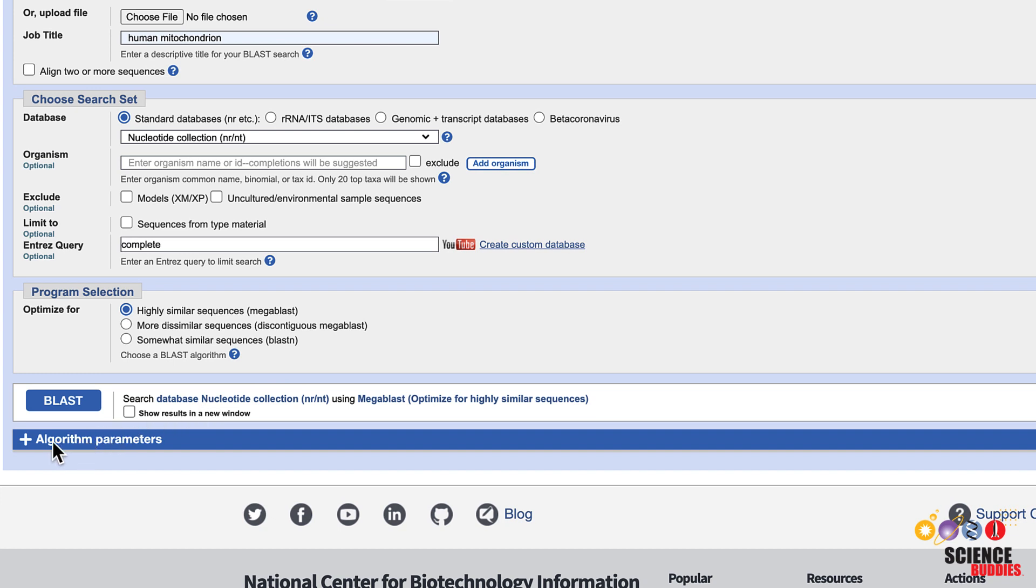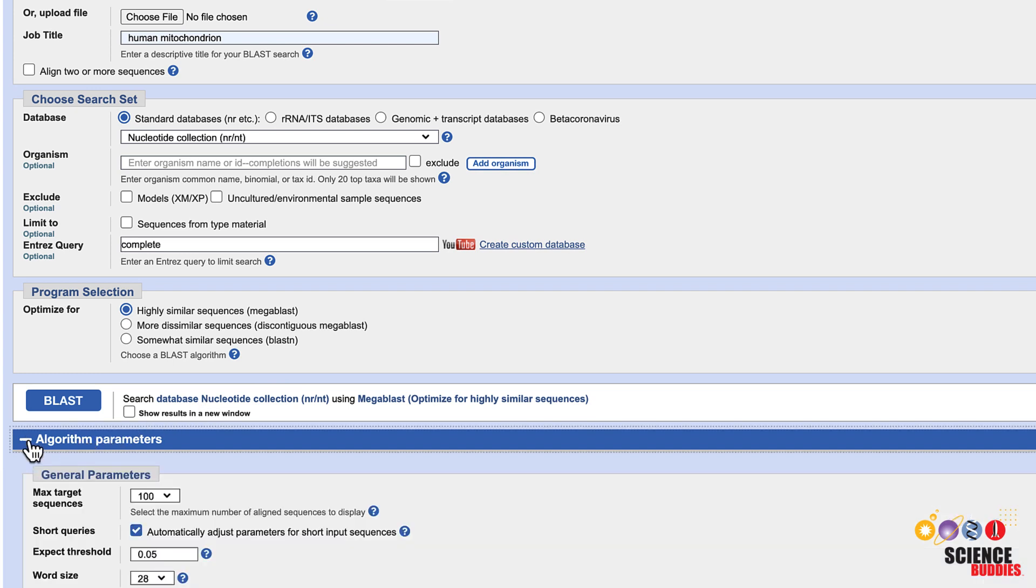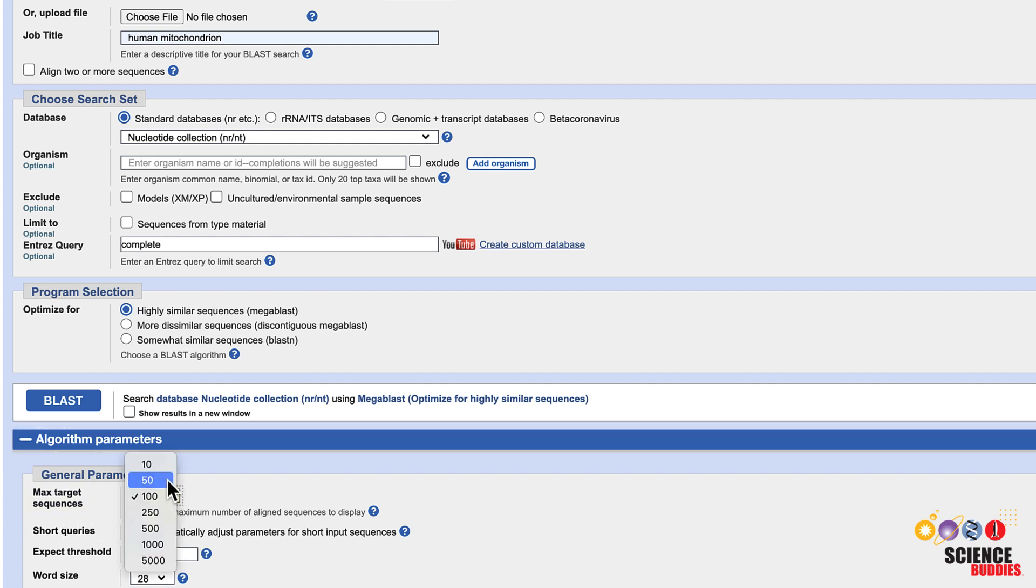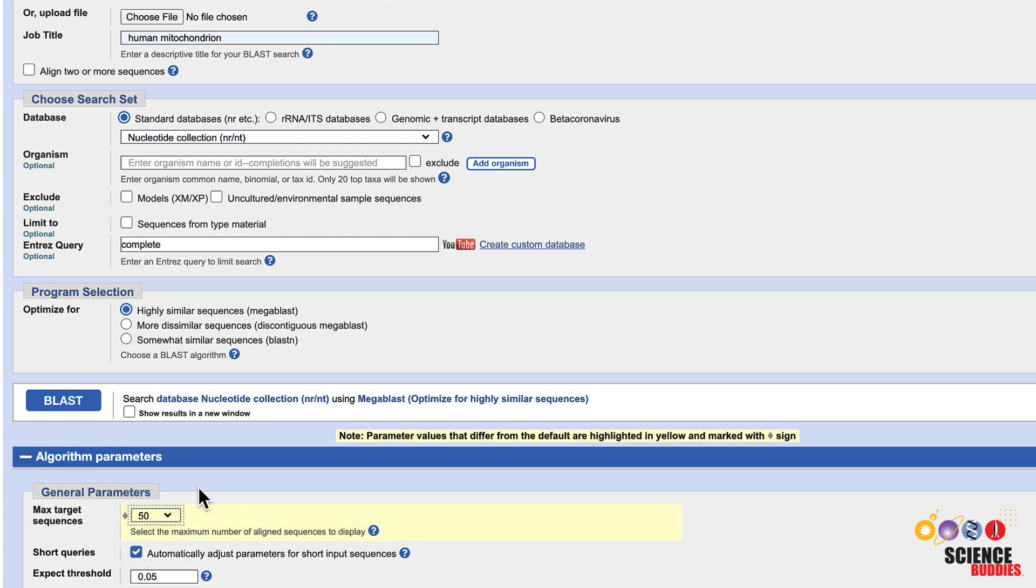One useful parameter in the algorithm parameter section below the BLAST button is the number of maximum target sequences. Changing the number from 100 to 50 means that the program will show you a maximum of 50 aligned sequences on your result page. Check the box Show results in a new window if you want to be able to edit your BLAST query later and then click the BLAST button.